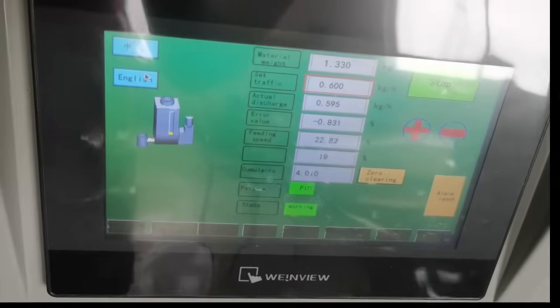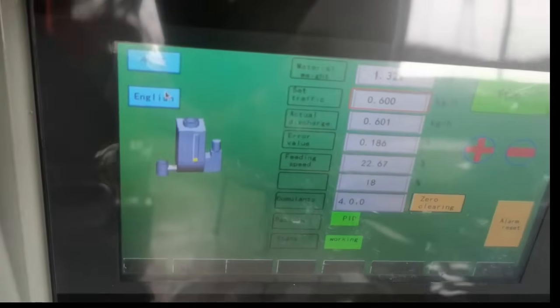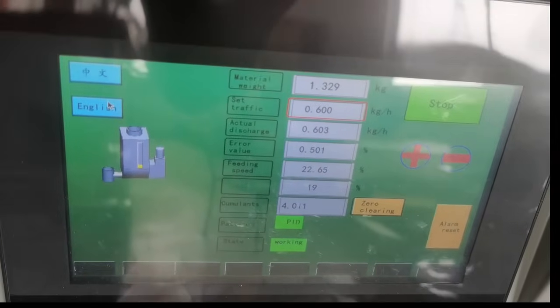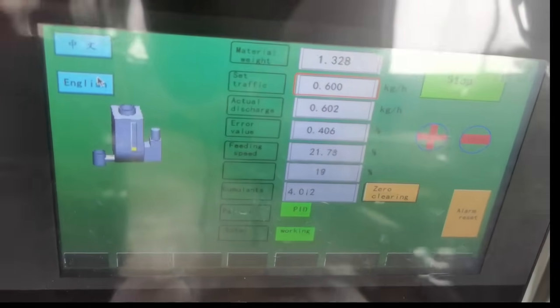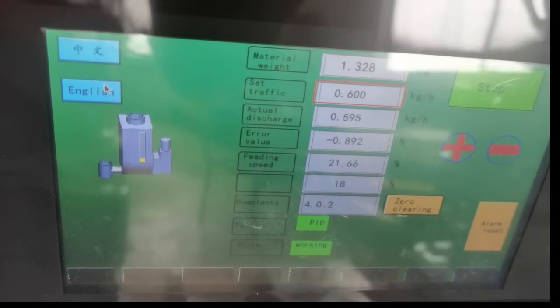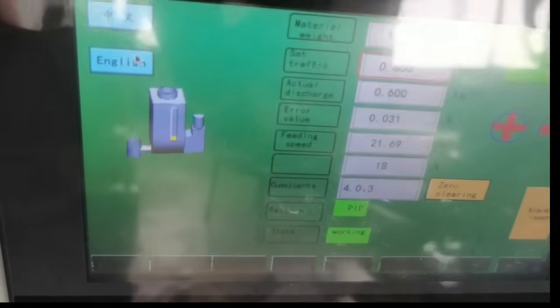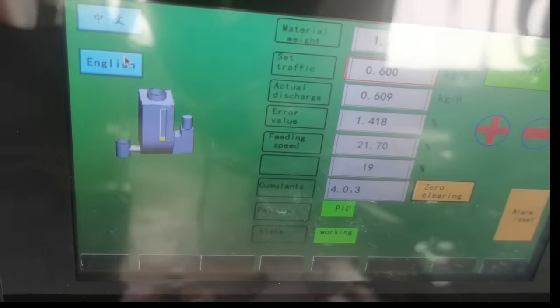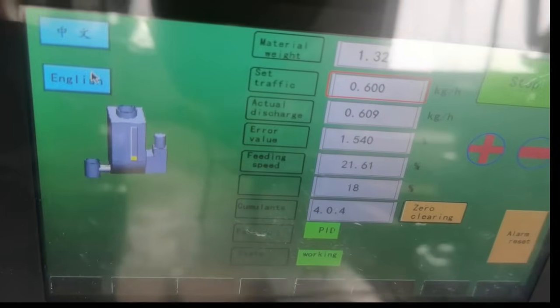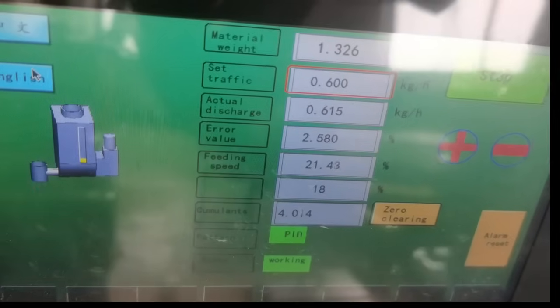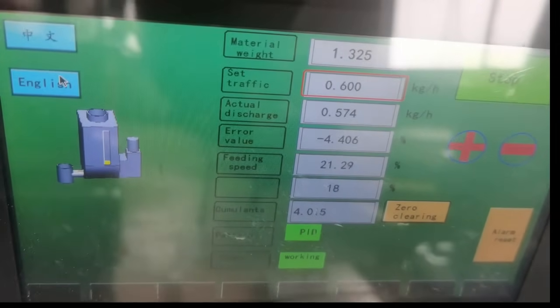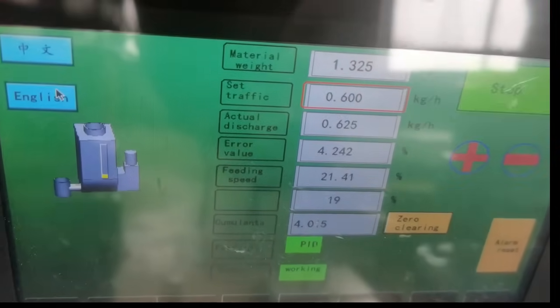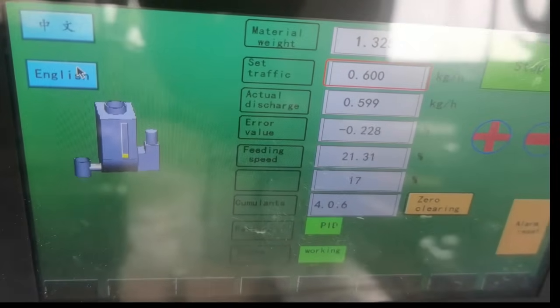This is the running page, operation page. You can see that the setting volume is 0.6, the minimum flow rate, and actual discharge flow rate is very similar. Other parameters like error value and feeding speed are also displayed.